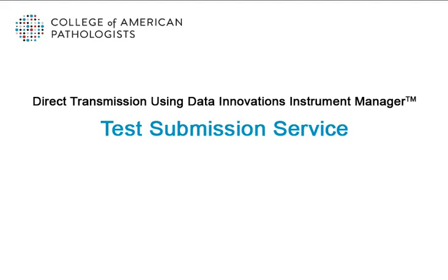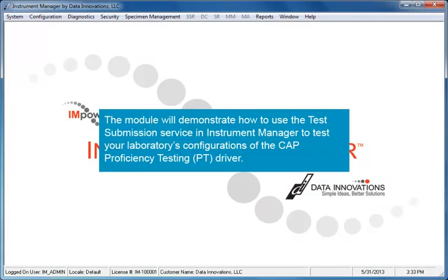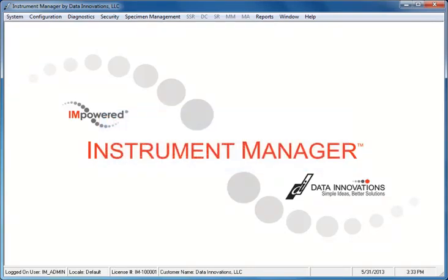Welcome to the College of American Pathologists Direct Transmission e-learning module, Test Submission Service. This module is intended for laboratories planning to use Data Innovations' Instrument Manager to transmit proficiency testing results directly to the CAP. The module will demonstrate how to use the Test Submission Service in Instrument Manager to test your laboratory's configurations of the CAP proficiency testing, or PT driver.